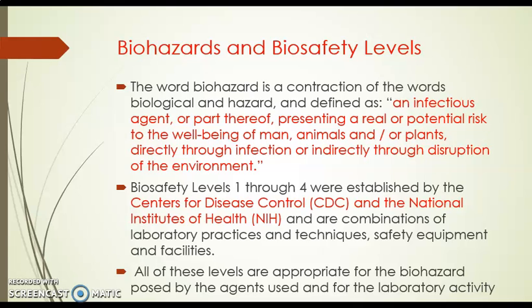Biosafety levels 1 to 4 were established by the CDC and the National Institutes of Health and are combinations of laboratory practices and techniques, safety equipment and facilities. All of these levels are appropriate for the biohazard posed by the agents used and the laboratory activity. So there are 4 levels, but here I am mentioning only the 3 types of biosafety cabinets.